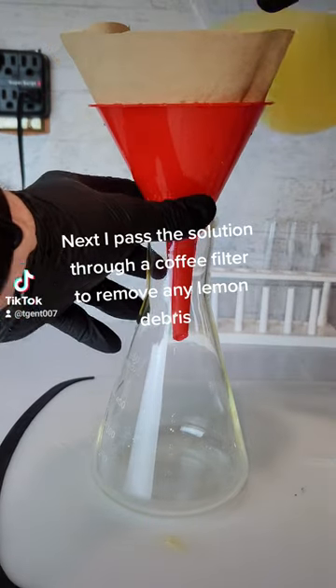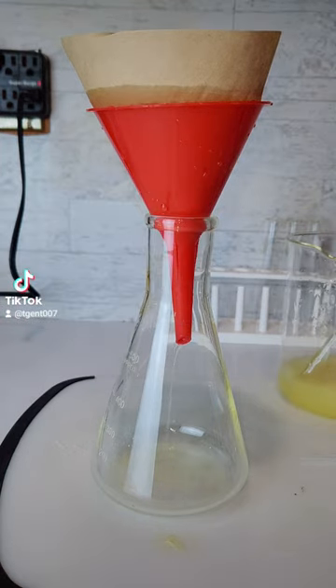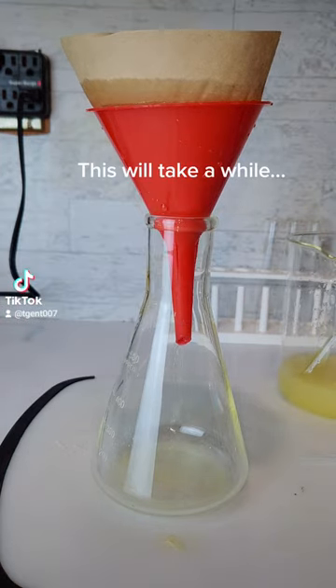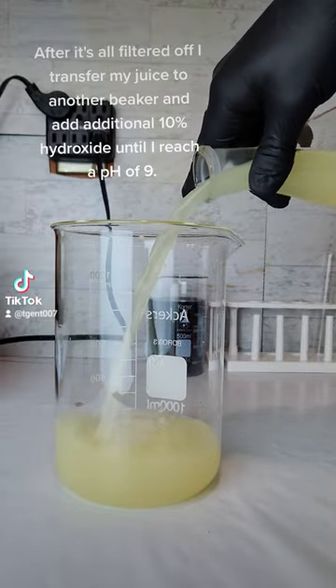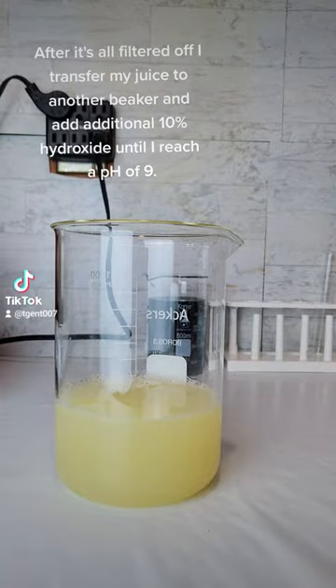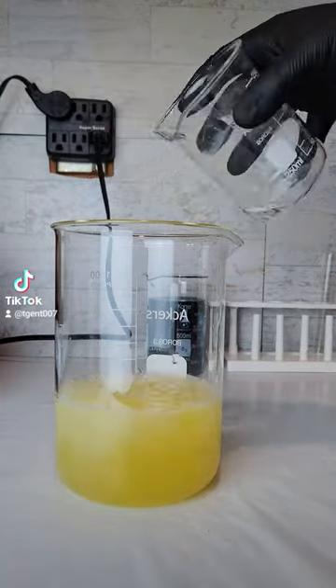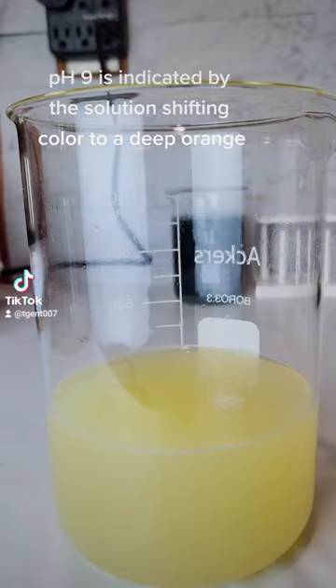Next, I pass the solution through a coffee filter to remove any lemon debris. After it's all filtered off, I transfer my juice to another beaker and add additional 10% hydroxide until I reach a pH of 9.